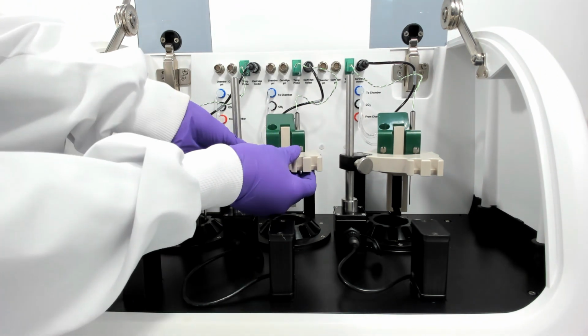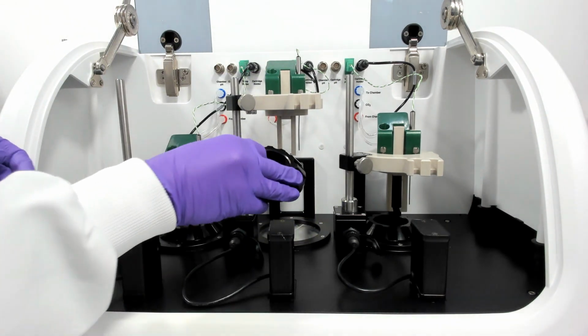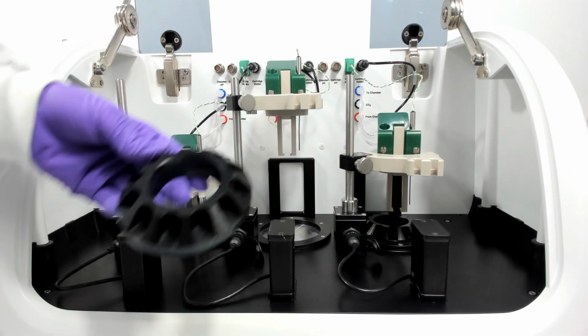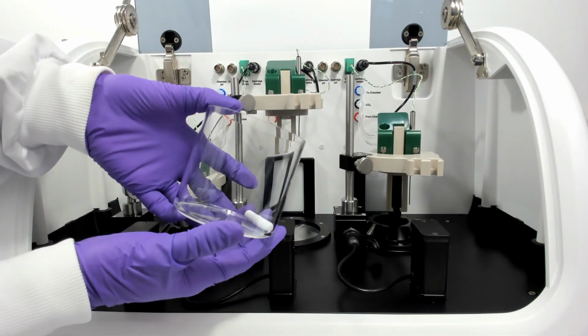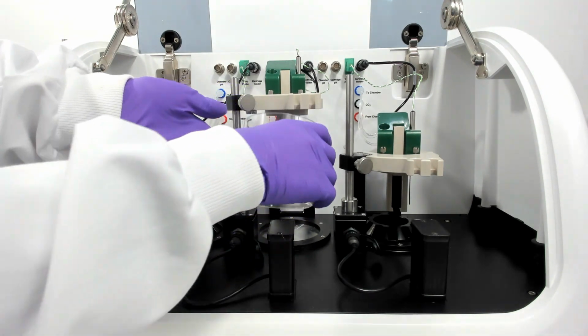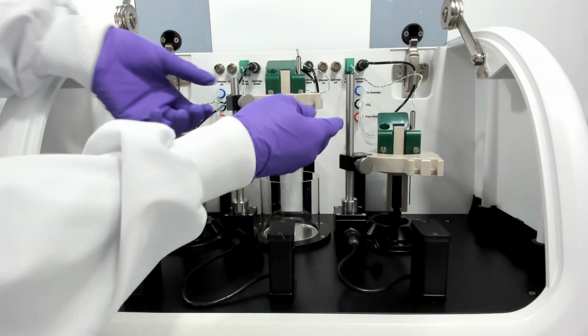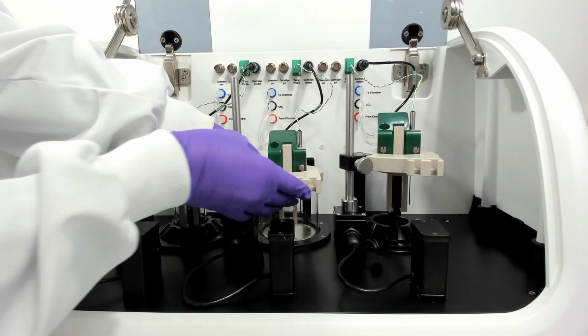And this is our larger vessel size. This is the 300 milliliter chamber size. And both of the chambers are filled with a bicarbonate-based buffer, simulating the interstitial fluid in vivo in humans. And that buffer is kept at pH 7.4 via the external CO2 bubbling for the duration of the assays.